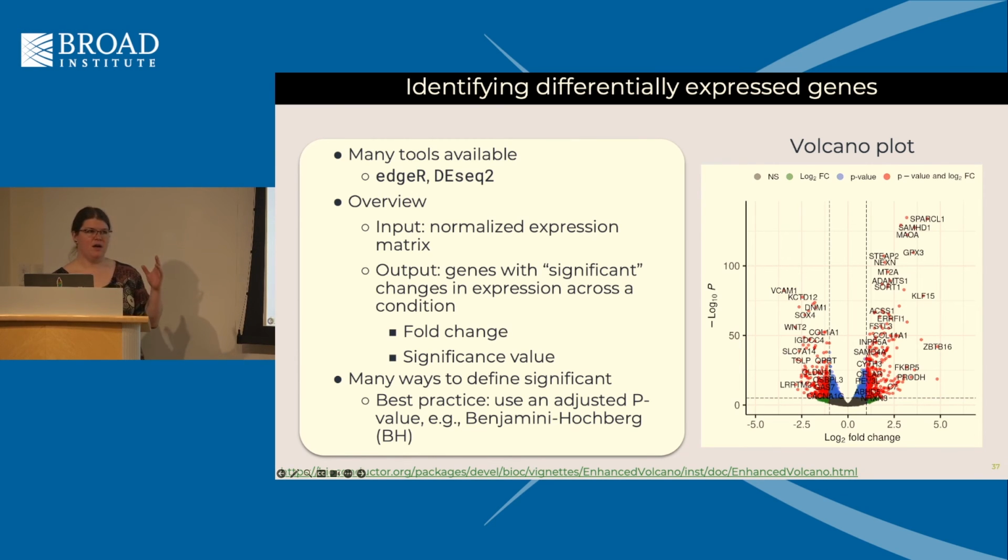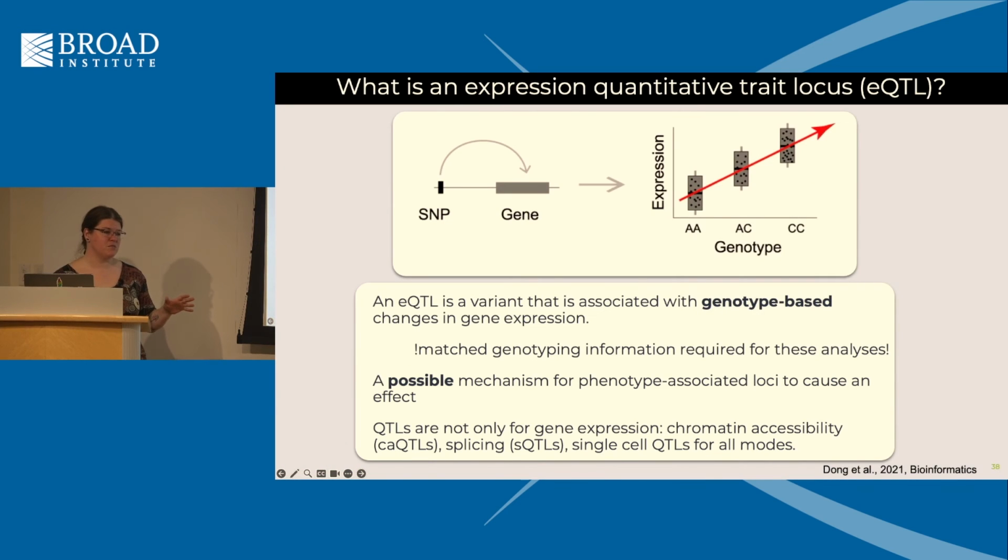I just think it's nice, but there are also lots of other great R packages out there as well. All right, so after that whirlwind, I've got about 4 slides on eQTLs because I was requested to have a little bit on eQTLs. This is not my particular area of expertise, but I think it's a really cool area because there's a lot of single cell eQTLs, and there's a lot more genotyping data coming online because it is just less expensive to sequence someone's genome than it was even a year ago.